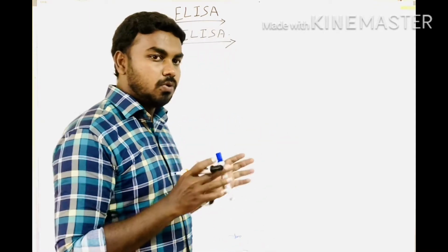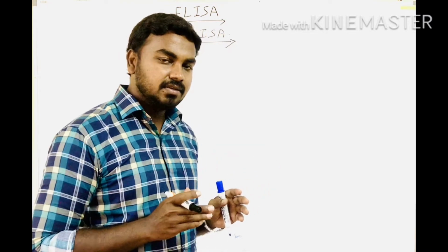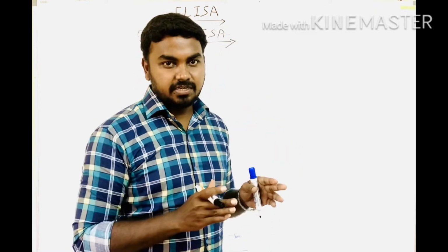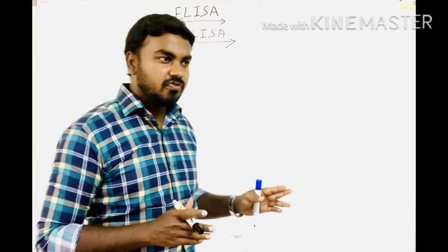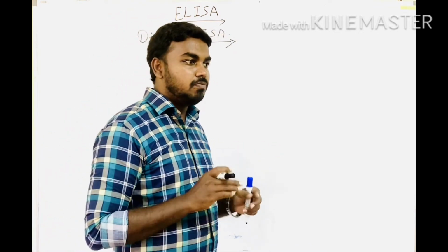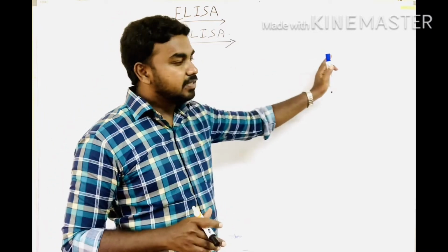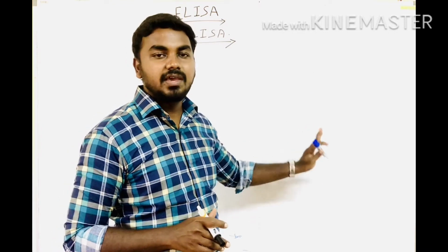Okay, now I am going to draw two diagrams. One is the sample which contains the antibodies, the infected serum, and the other sample which is not infected, which may have other kinds of antibodies. So for example, I'm going to use HIV. It's a common example, but don't think that is the only example. So I'm going to draw one side which is the HIV infected sample. On this side it can be any other infection, so it cannot bind with the specific antigens.